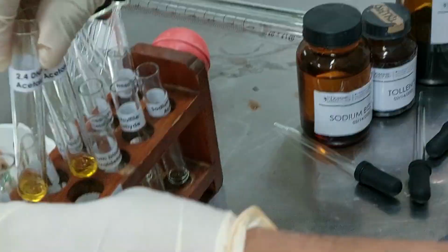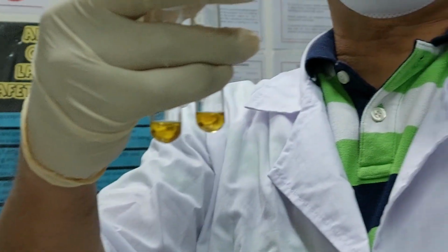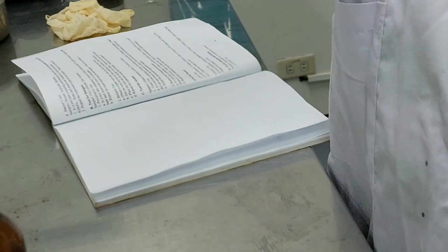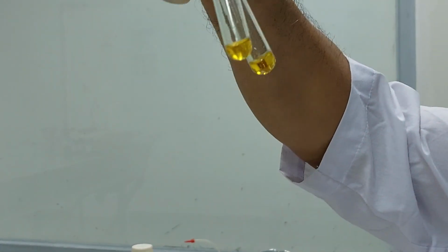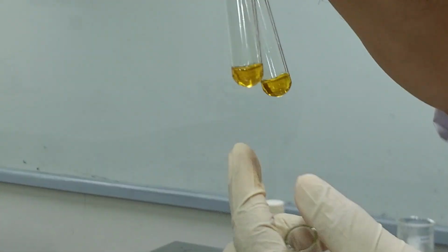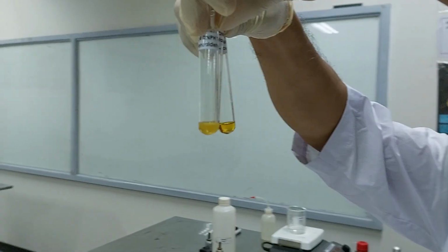Okay, now we need heating for this. But if you notice, even without heating, your benzaldehyde is very reactive, you see? It already reacted, forming that precipitate. That cloudy color is the precipitate. But the other two, acetaldehyde and acetone, we didn't observe any change yet. So I think for acetaldehyde, it turns cloudy already, as you can see. But benzaldehyde is very reactive.